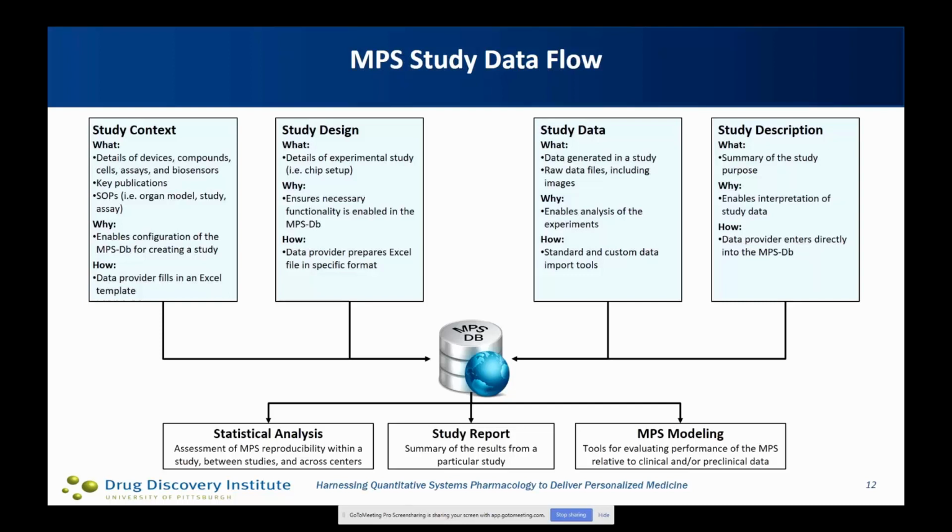And then in the end, some description of the study, what its goal or purpose was, in order to give a high-level view to the user who's opening up this study of what the study is about. So that also helps in terms of the interpretation of the data. So then from this data we can do statistical analysis, generate reports, and do computational modeling, as I mentioned earlier.